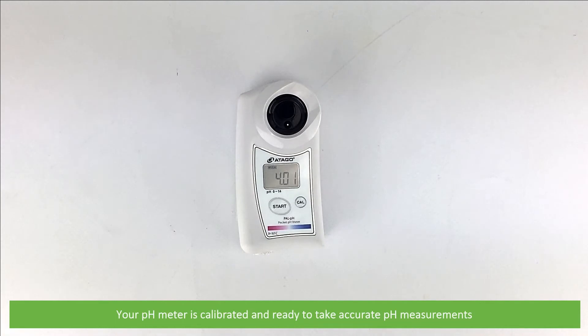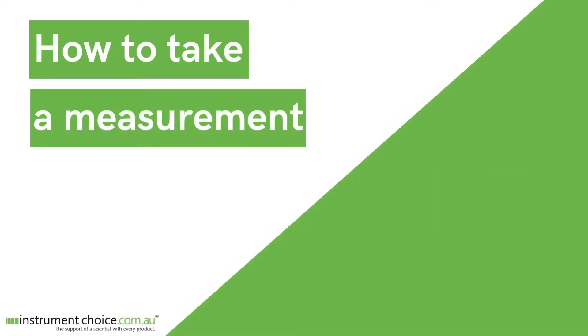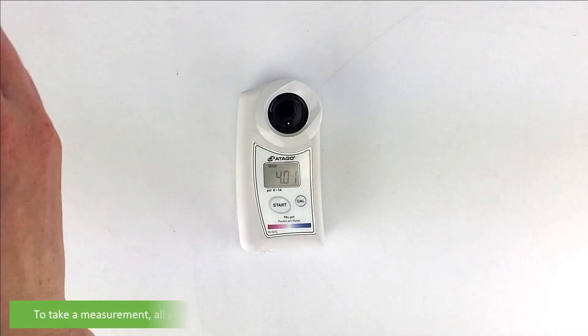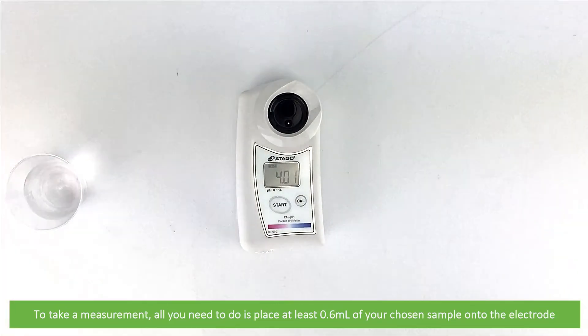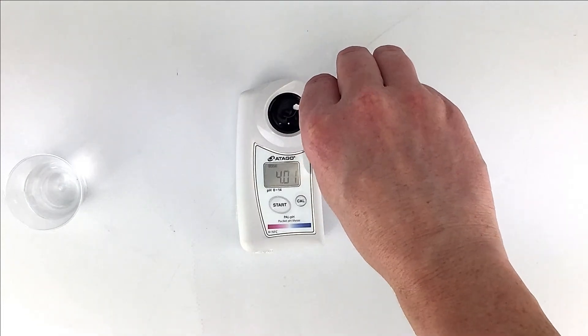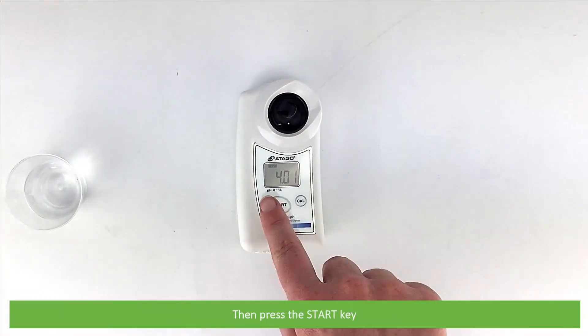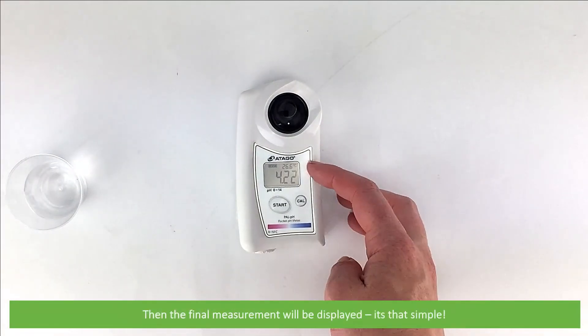Your pH meter is calibrated and ready to take accurate measurements. To take a measurement, all you need to do is place at least 0.6 mils of your chosen sample onto the electrode, then press the start key. Three dashes will display as the meter reads the sample, then the final measurement will be displayed. It's that simple.